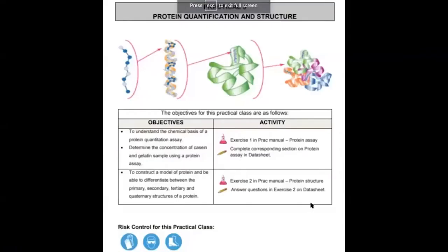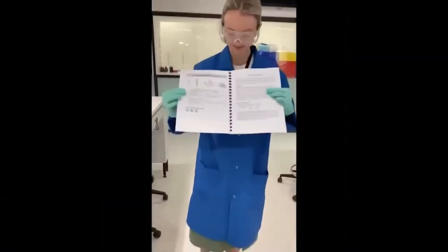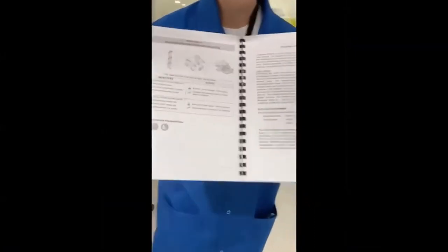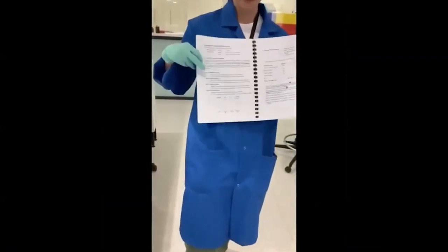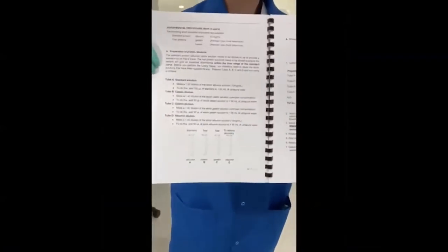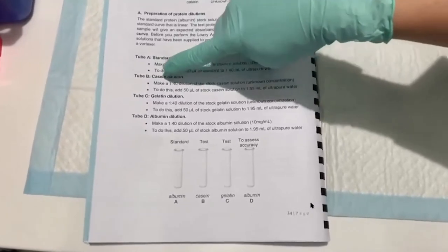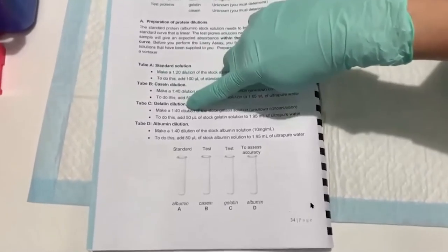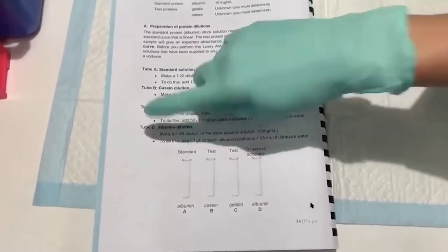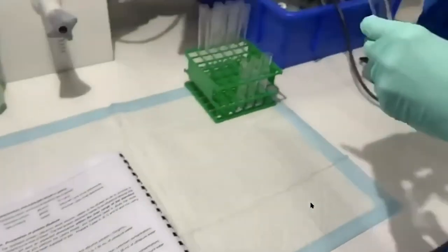Today's prac goes from page 32 of your lab manual all the way through to page 40, but we are only going to be doing the experimental part which finishes on page 35. The prac today is going to be demonstrated by Charlotte Fleming. The first step is labelling our tubes A through D, each containing a different protein. We always need to make sure we label our tubes so that we do not get confused.